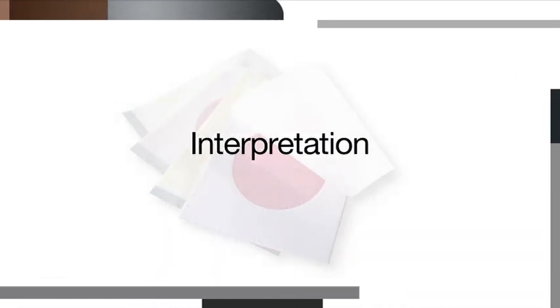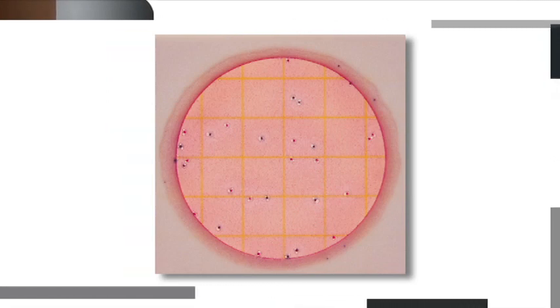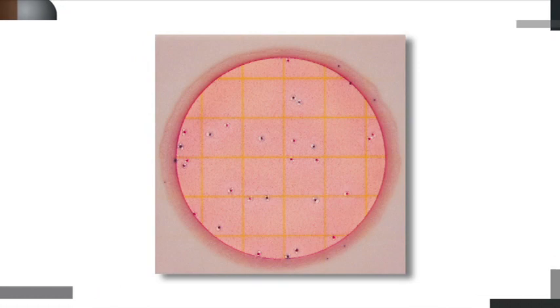The next step in microbial testing is interpretation. The indicator dye in 3M PetriFilm E. coli coliform count plates colors colonies red and the top film traps gas produced by coliforms. Count red colonies associated with gas bubbles as coliforms.